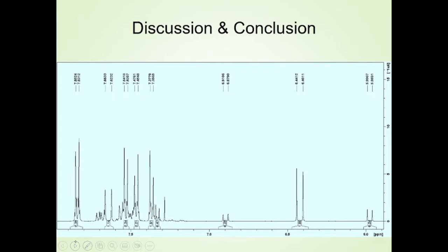And we also have a lot of other aromatic stuff, probably from triphenylphosphine oxide. When you have that, you probably will not see the aromatic peaks for the minor isomer. Integration here is 0.25 relative to this one. And so the aromatic peaks will be twice that, since it's a 2-to-1 ratio. So you expect peaks about 0.5. That's going to be lost in here. If you can't find them, don't worry about it. Just leave it out of the table.